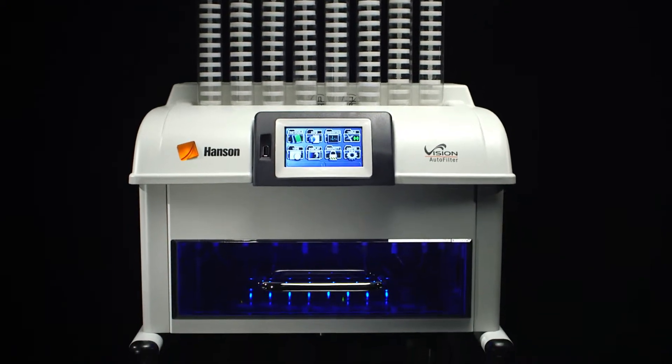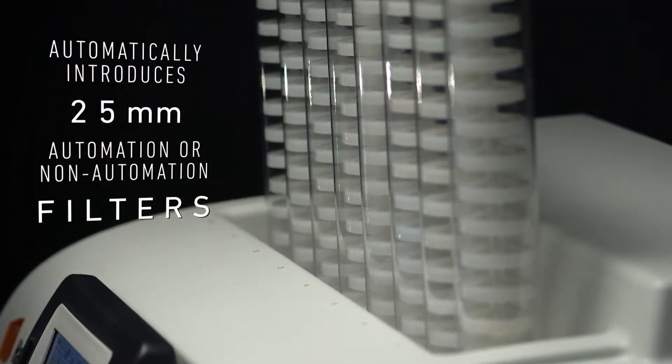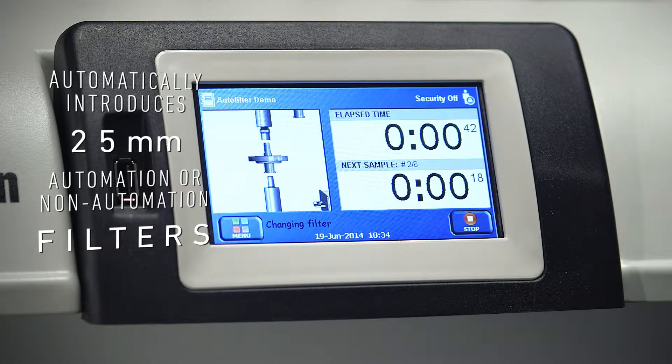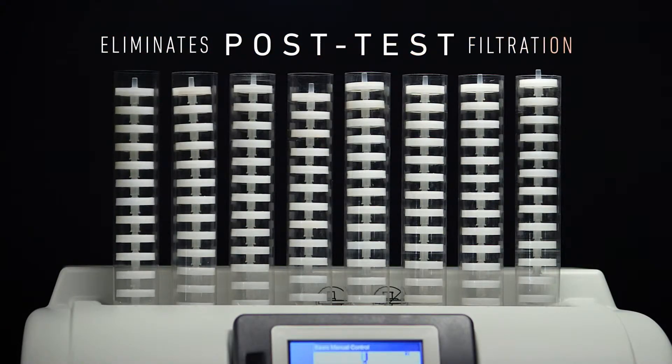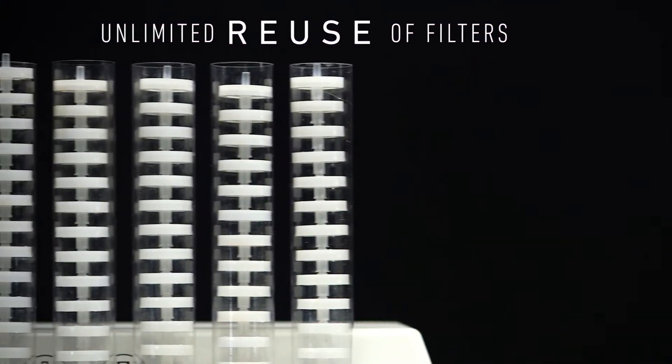The Vision Auto Filter Changer automatically introduces 25 millimeter automated or non-automated syringe filters into the fluidic path of your dissolution samples, eliminating post-test manual filtration. Feeling limited by your instrument? Now you have the power to choose.